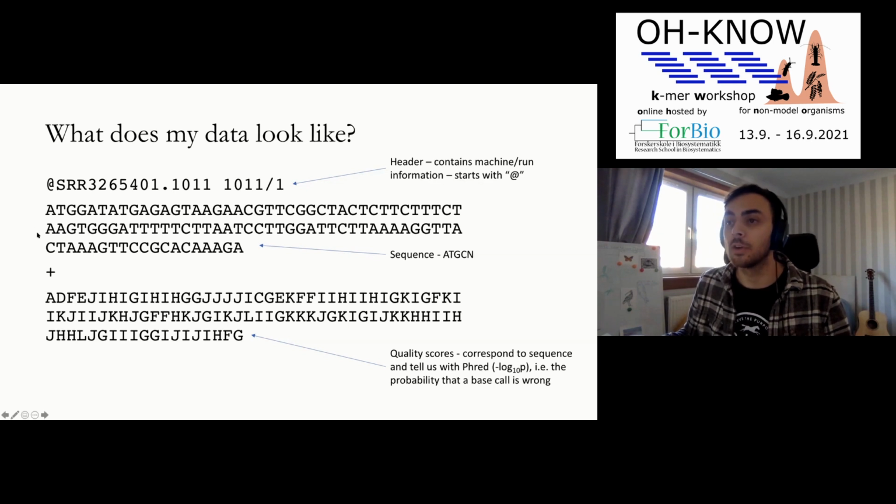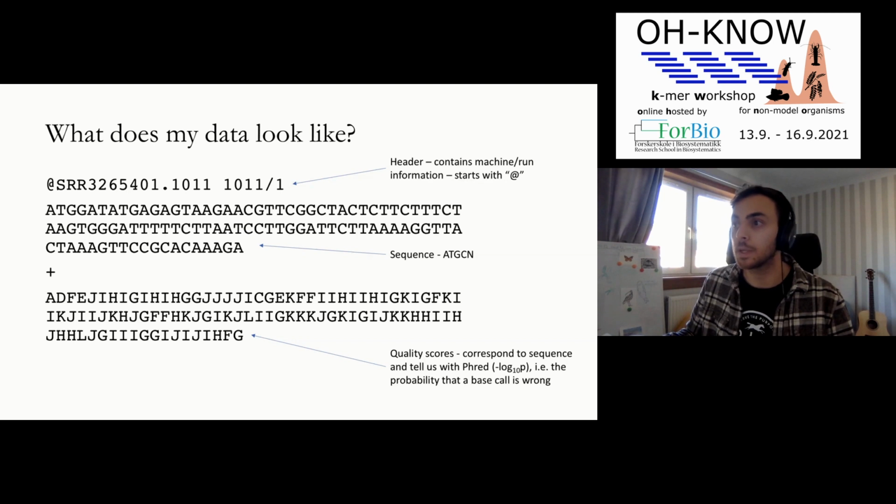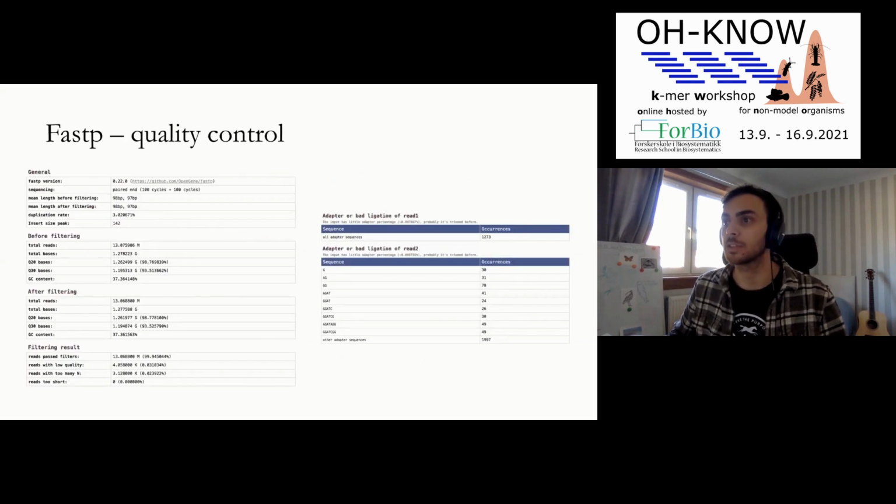Now, one of the things we'll be going over in the tutorial in a bit is using Fastp. Fastp is a quality control or quality checking software, which I think is very useful.